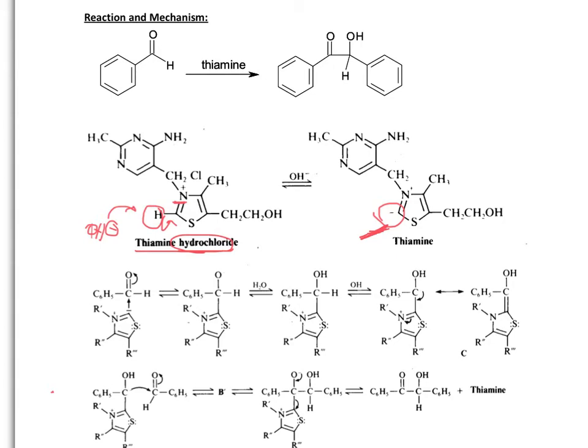It doesn't last for a very long time, but it tells you that the active species has been generated, and that color will fade out a little bit. That color is because of the conjugation that is now set up in the system. As long as your solution looks like a faint yellow color, it'll be fine.